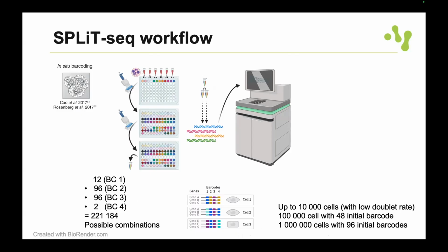So this is the split pool. So Parse is one technology. The other technology is called Scale, or commercialized by Scale now. So there were two papers when they originated. It's also called SCI-seq, SCI. So these are based on split pooling.